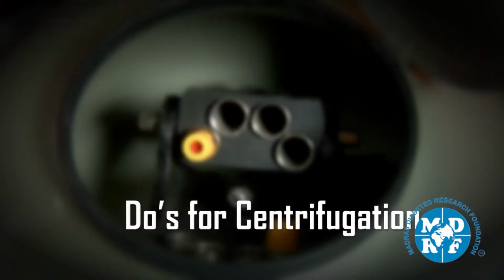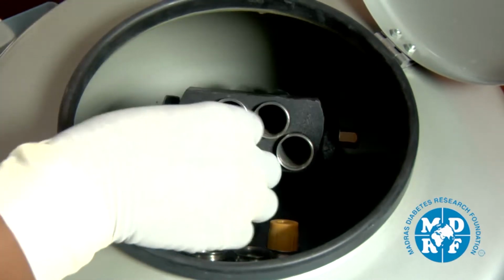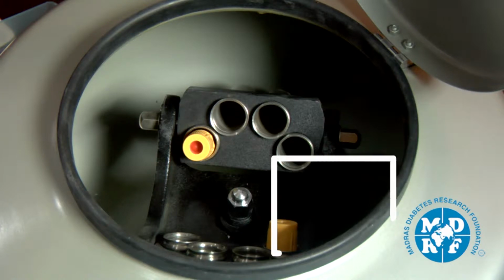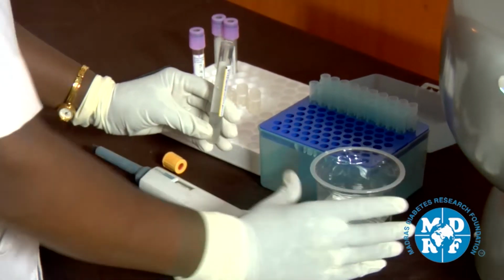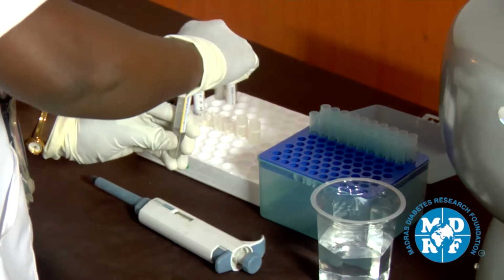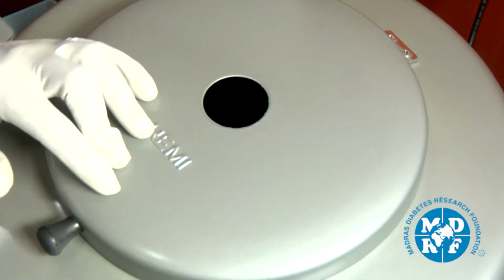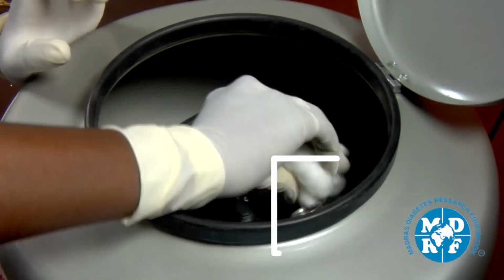Do's for centrifugation. Ensure samples are balanced in the rotor. Only equally balanced tubes must be placed diagonally opposite to each other. If necessary, an empty vacutainer tube must be filled with water and kept diagonally opposite for balancing. Close the centrifuge lid properly. Clean the rotor chamber once a week.